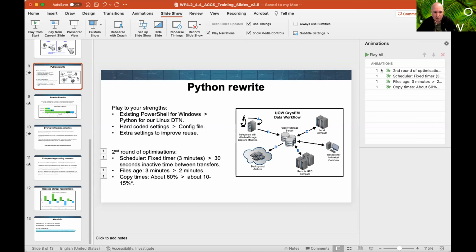Writes to backup are a little bit slow, and I think that's the S3 storage here at the university. It's designed for large amounts of storage, not necessarily performance. It's one of the issues we're running into at the moment: the microscopes are generating data so fast that we can't write it to backups at the rate that it's being generated. So that's something that we're looking into at the moment.